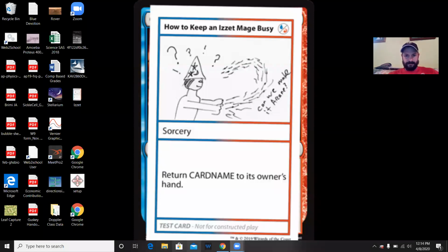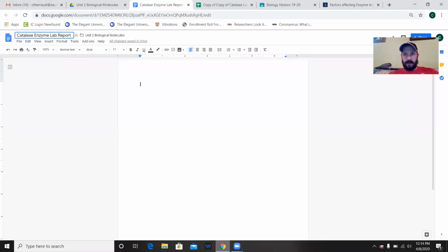Hello. So a lot of students have been struggling with the Catalase Enzyme Lab that didn't finish it before we left. So I'm going to create a video that kind of shows you the process of creating that Catalase Enzyme Lab and writing it effectively. So let me start. I'll share my screen with you. Screen is shared. And let's open some documents up.